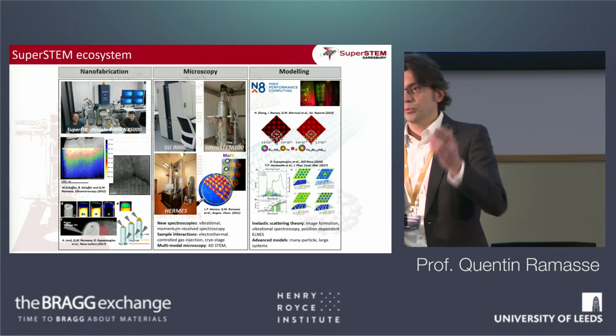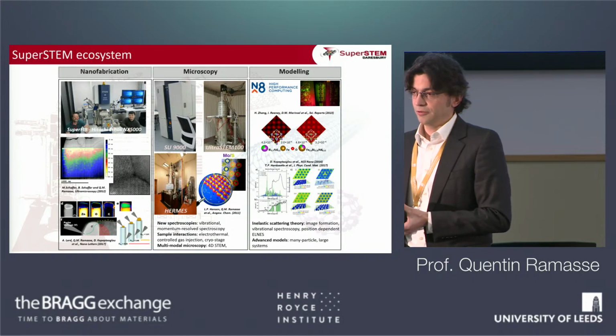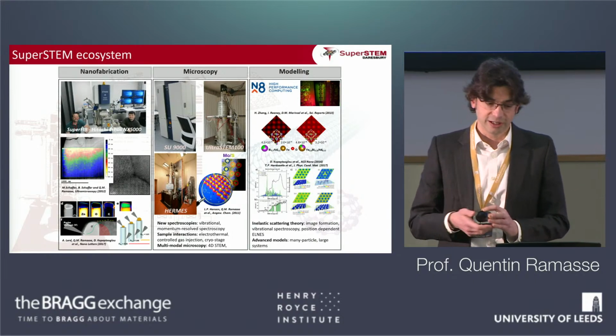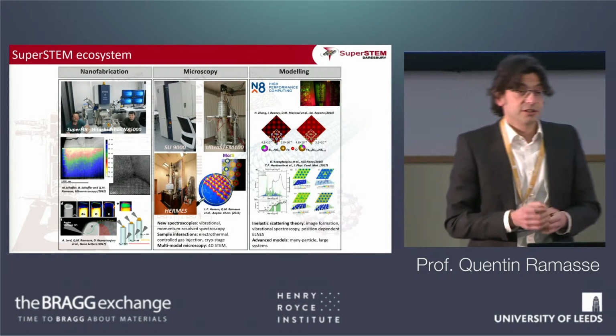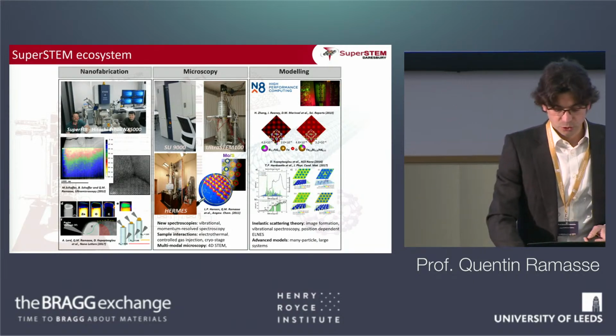Once you start looking at bulk and much, much larger structures, then of course that facetious phrase, a synchrotron in the microscope, doesn't quite apply anymore. Maybe you have to go through slightly different types of interactions with your sample to characterize them. And therefore, one important aspect of our work is making samples thin enough using, for instance, focused ion beam, which we've also got at the lab.